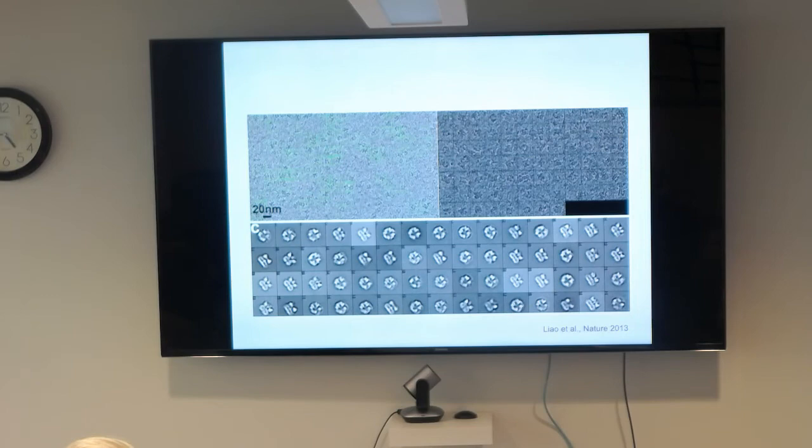You want to know whether you get anywhere close to a good three-dimensional coverage of the molecule. You immediately spot if there's only one particular view represented. So in this particular case, it looks pretty much like there are two views, and that's pretty much it. There are variations of two views, or some kind of side views and the other way.